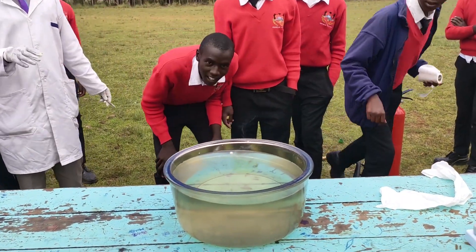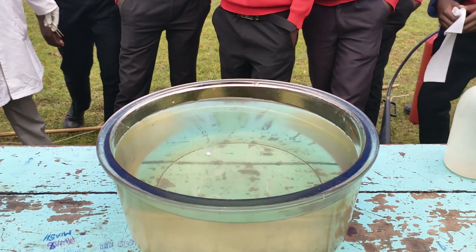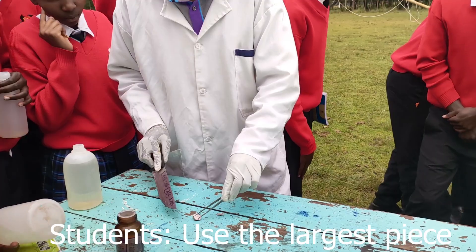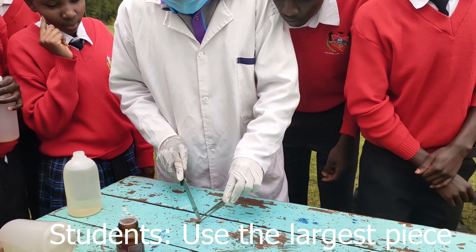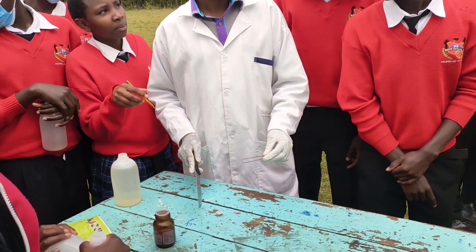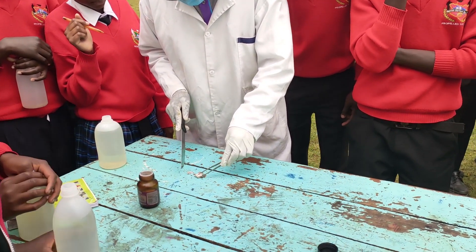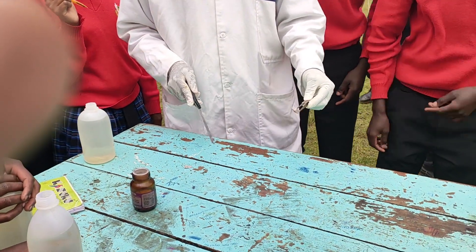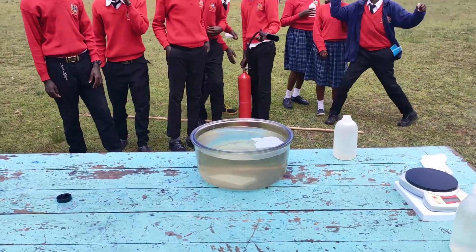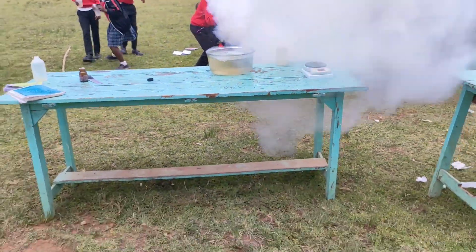We started our experiments using sodium, and for sodium it is simple — it melts into a silvery ball, darts on the water surface, producing a fizzing sound. And like expected, my students requested that I put even a bigger piece of sodium in water, and this time round I obliged. After catching fire, the boys would do the necessary.